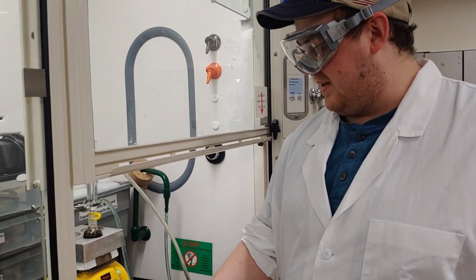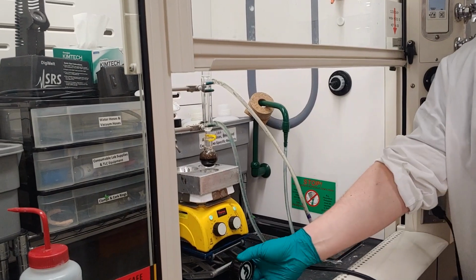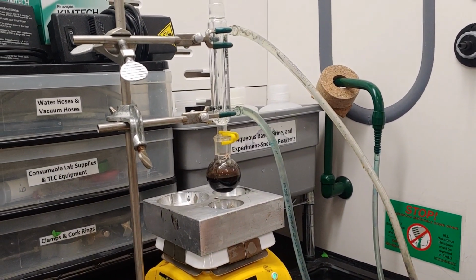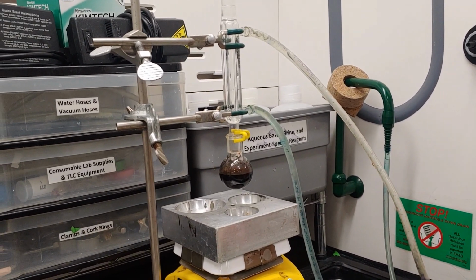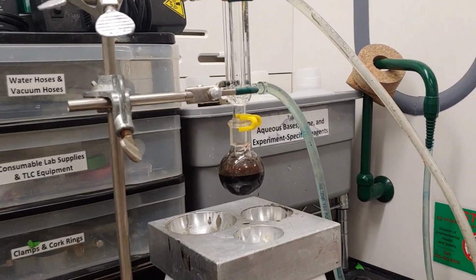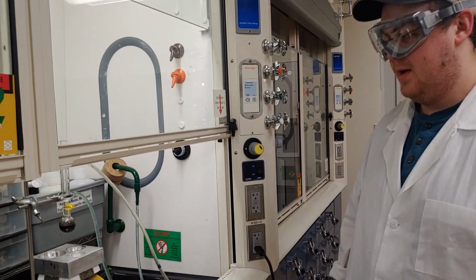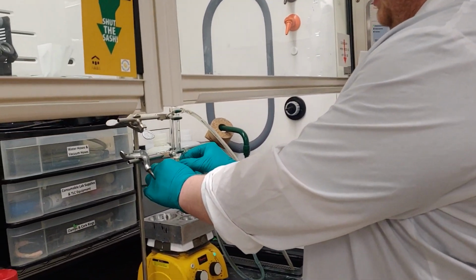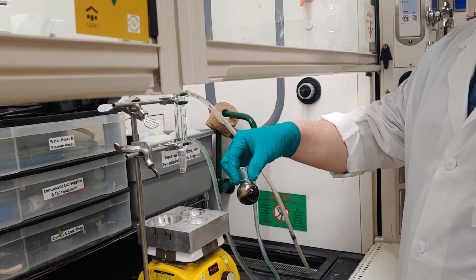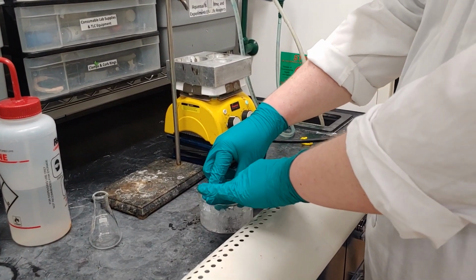So now that I've been heating this for 10 minutes and the reaction has gotten significantly darker, I can now stop heating it. So remove the hot plate from the flask. I'm going to continue stirring and allow this to cool for about 10 minutes down to room temperature. Alright, so now, since my reaction mixture has cooled down to room temperature, I can put it in an ice bath to further crystallize out a crude product.